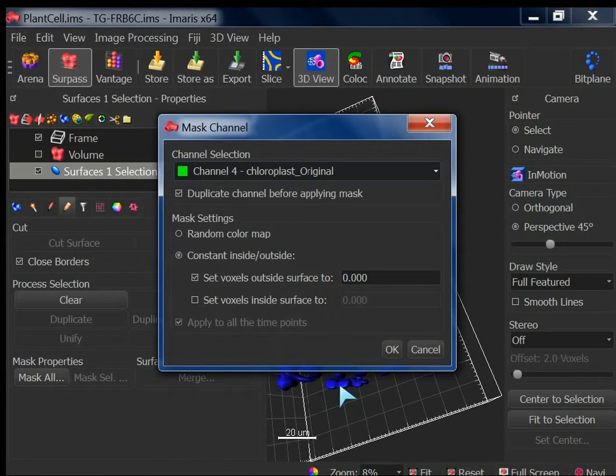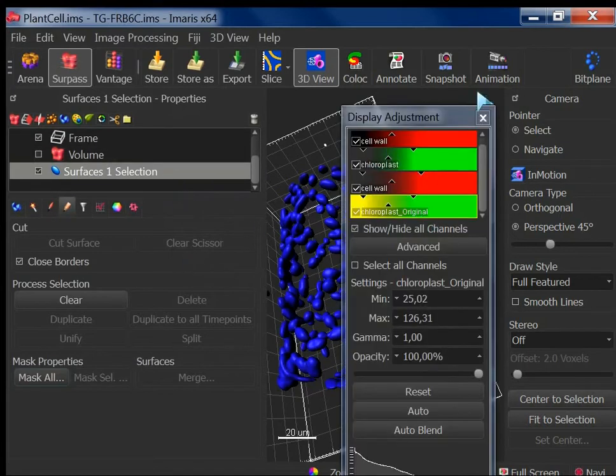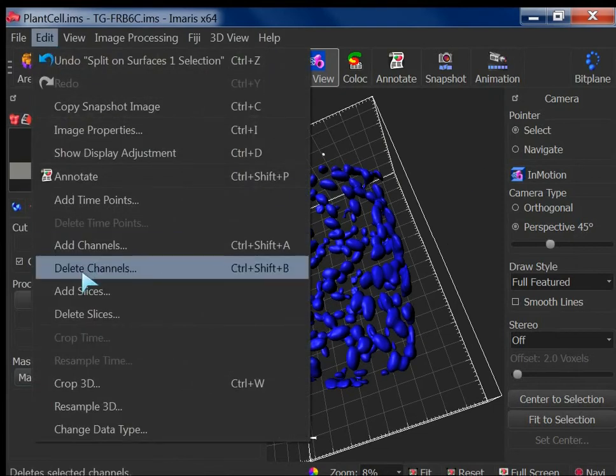Because it took me long to understand. But you understand what we want to do. No, can you, from the beginning, why are we applying the mask on all? What's the purpose of this? Let's say, okay, maybe with this, sorry, I can tell you how. No, that's fine. That's really good, because then we can actually go around all these options.